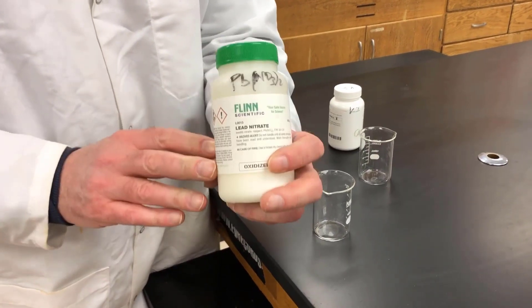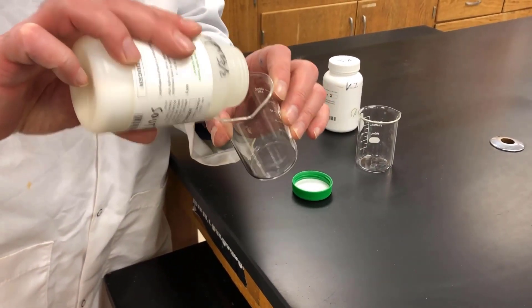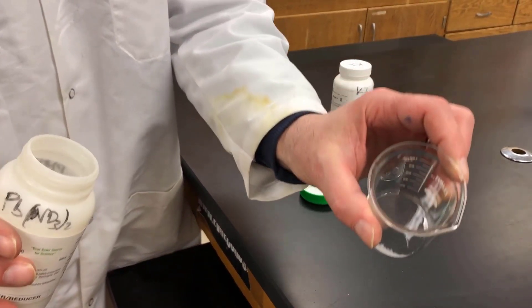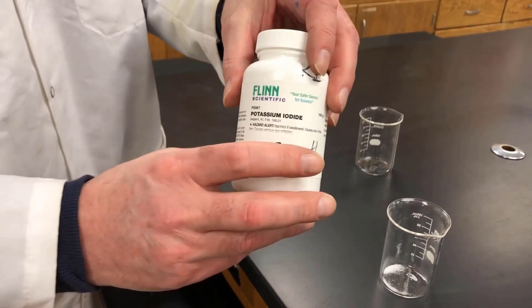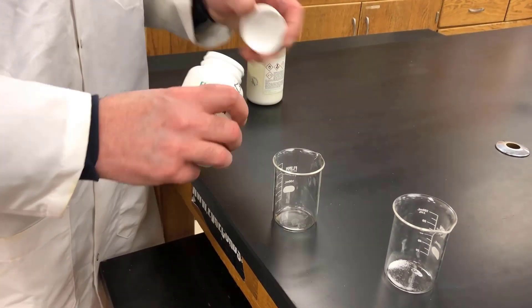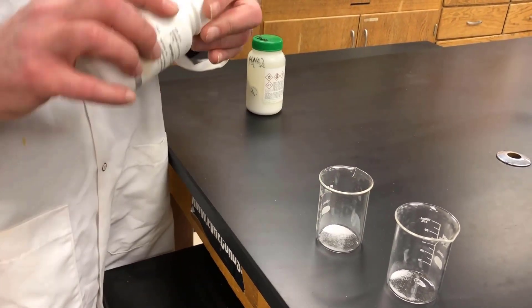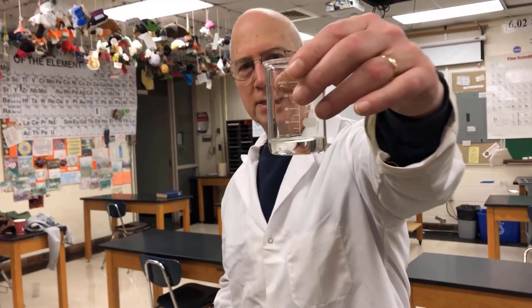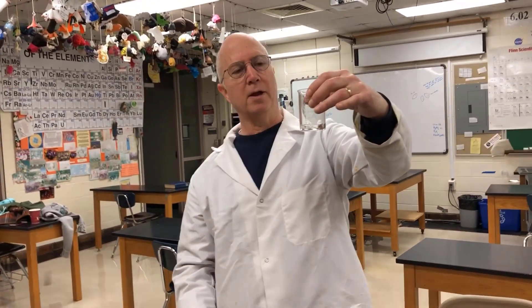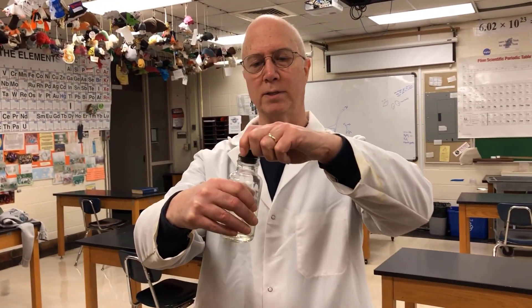Okay, so this is lead nitrate — lead nitrate is just a white solid. And potassium iodide — potassium iodide is just a white solid. So this clear liquid is lead nitrate dissolved in water. You can see that it's dissolved, you can't see it. So it's solid lead nitrate dissolved in water — aqueous lead nitrate. And this clear liquid is solid KI dissolved in water, so aqueous potassium iodide.